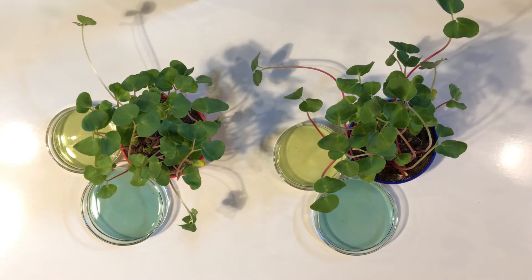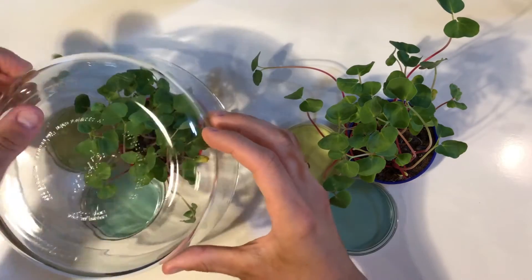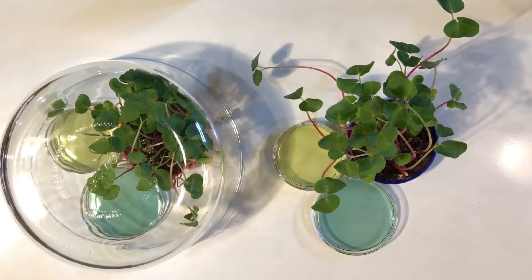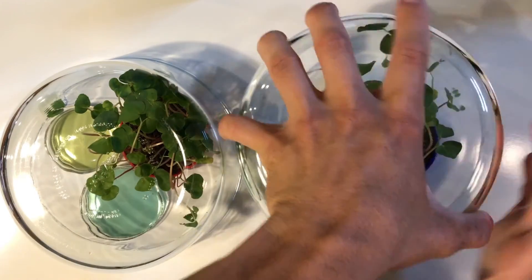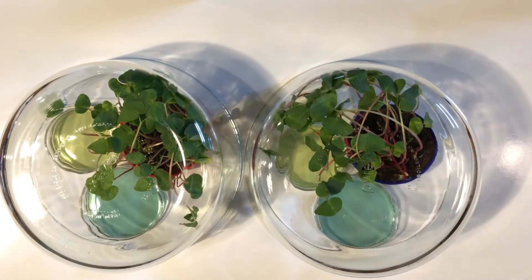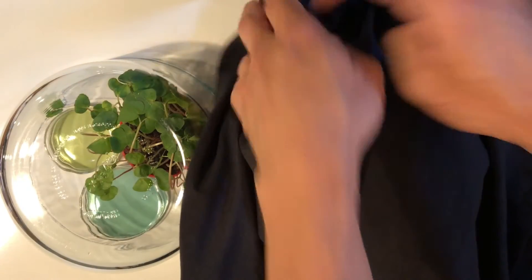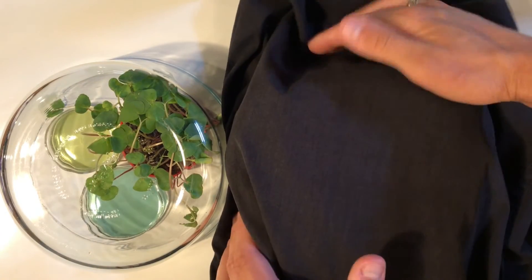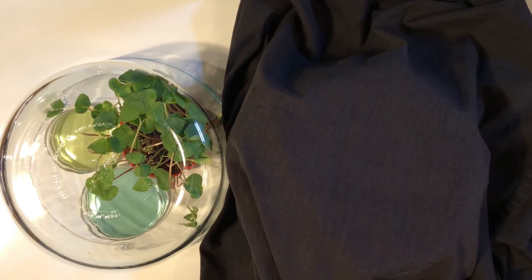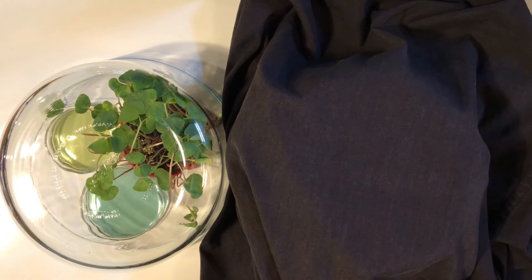The BTB is acting as our responding variable. Now let's think about our manipulated variable. We want to figure out what light does to the function of plants. So let's cover up one group of plants with a dark cloth, which will keep them in the dark. The other we will leave exposed to bright light. This way, the only thing that differs between the groups is the presence of light.